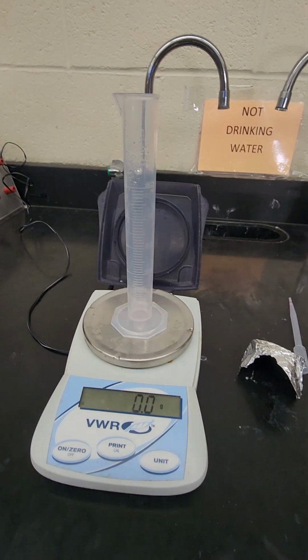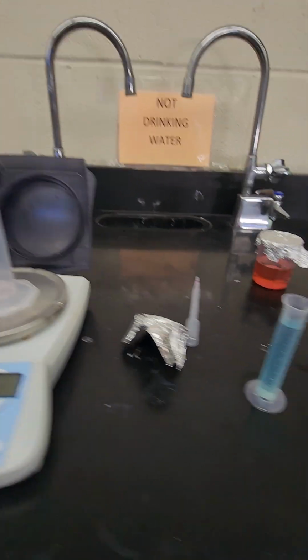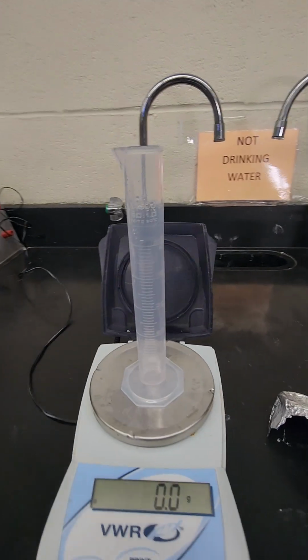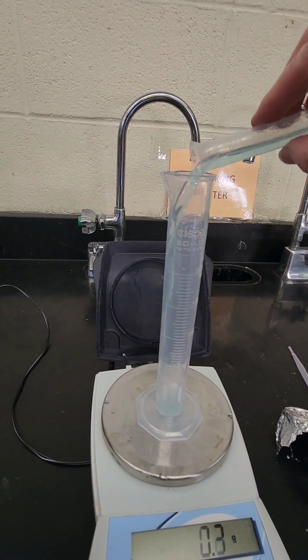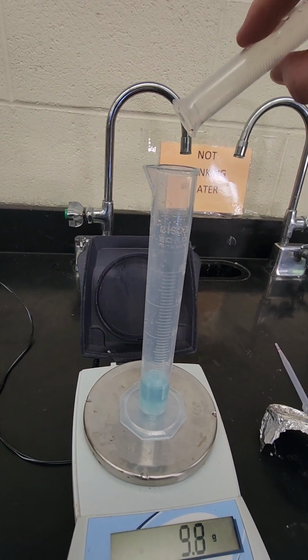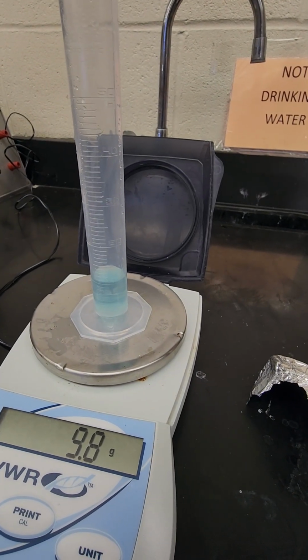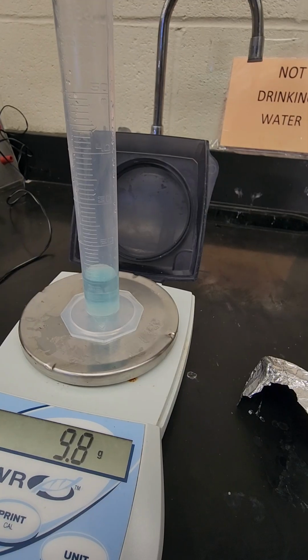And now I'm back. My graduated cylinder is clean. I've got 10 milliliters of the blue, and again, the blue liquid is just plain water. So I'm going to pour 10 milliliters in, and I get a mass of 9.8. I'm going to write that down into the data table for 10 milliliters.